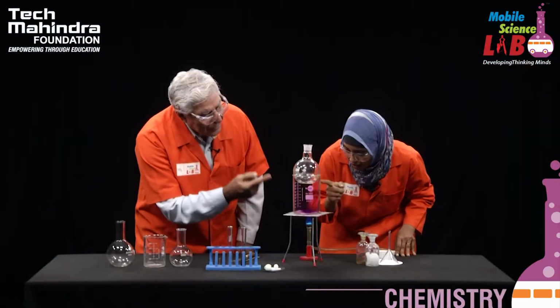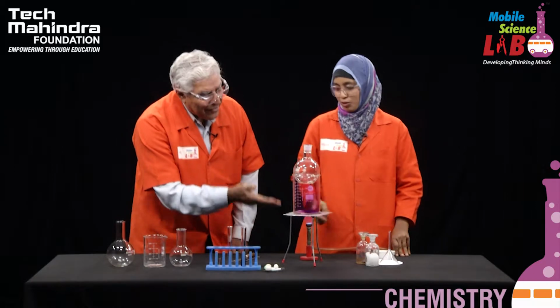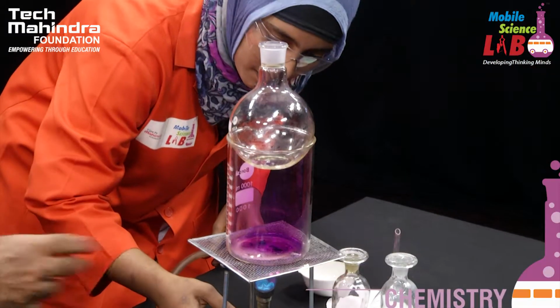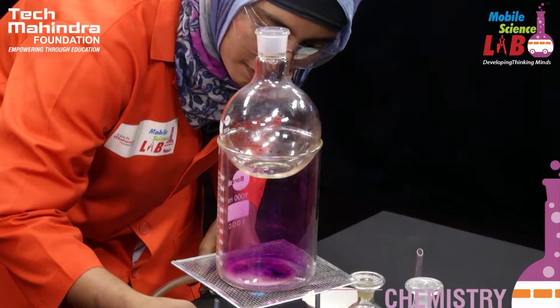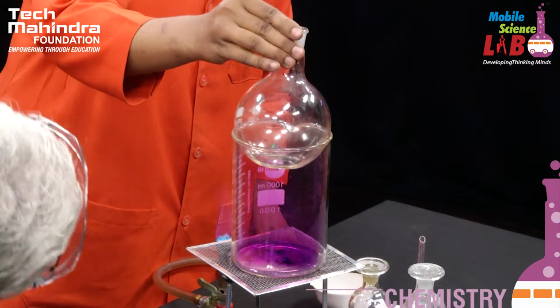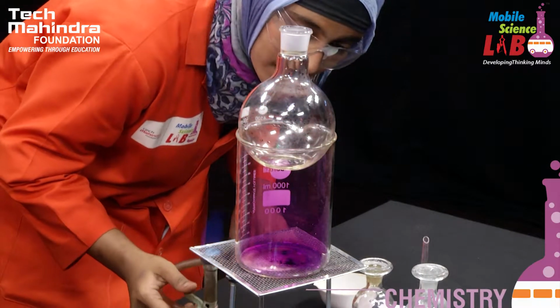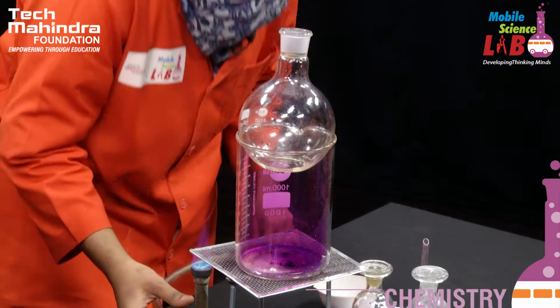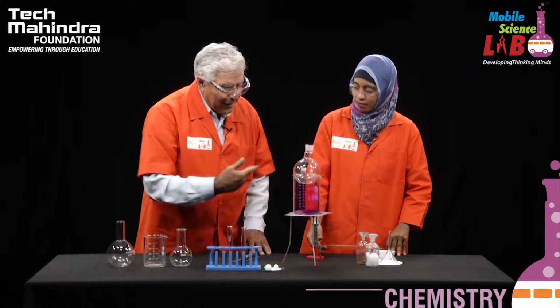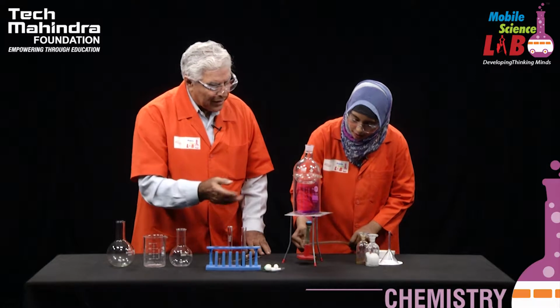We can see some crystals. Yeah, that's right. You can also see on the surface of this thing. Please heat it a little bit more. That's all. Just a little bit more. You can see beautiful small shiny crystals of iodine going up and down. Continue here. Yeah. Gently heating, gently.